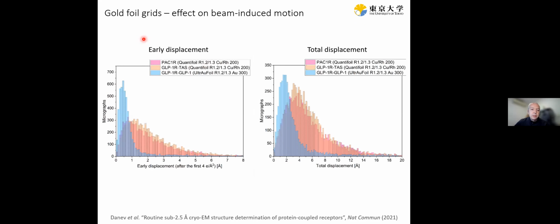In this case, I plotted the displacement because the values that come from RELION, which represent the summed motion frame to frame, the absolute values added together, seem to be biased or influenced by noise. So if you have plenty of frames in your movies, the noise between frames starts to accumulate, and the plots I made showed less of a difference.